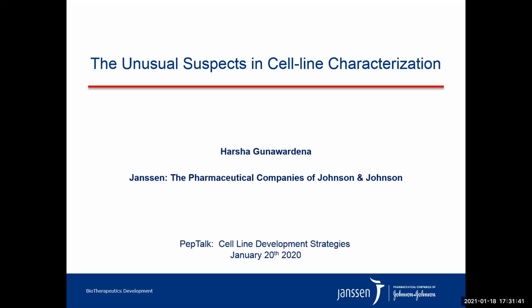As seen in the title, I will present several unusual product characteristics in biologics that we term unusual suspects and how mass spectrometry can reveal the nature of these unexpected results. In today's presentation, I will share several case studies from our lab highlighting the techniques used in fully characterizing these anomalies during cell line development.